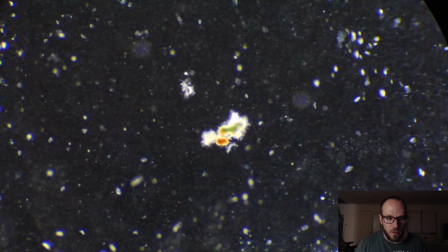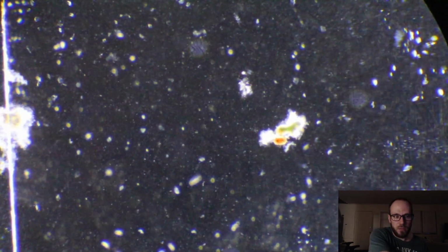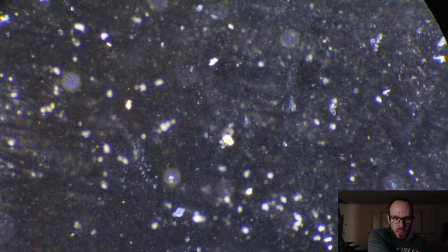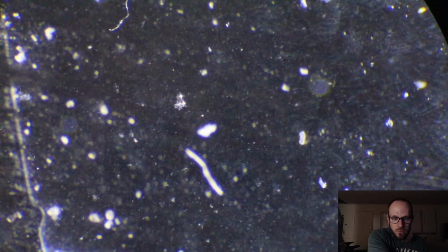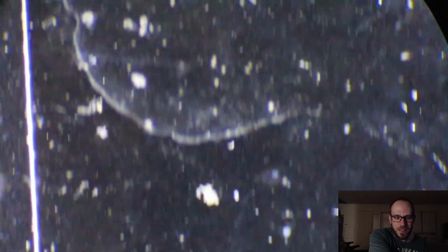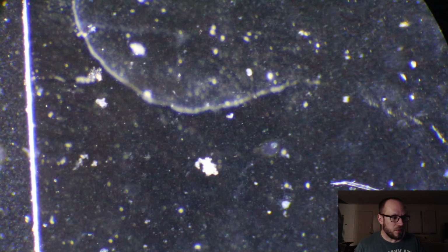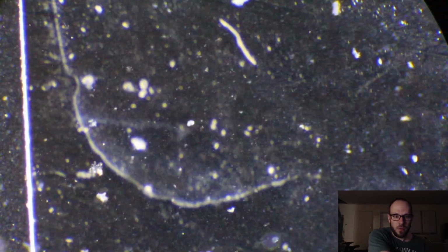I'm still playing with this and figuring stuff out, so all of the 0 people here are kind of my guinea pigs. So yeah, that's a bit of lichen you're looking at right there, a microscopic bit of it. I'm a little surprised that we're not really seeing much of anything yet, but we should. And fear not, even if this slide is somehow a dud... Oh, there's another Paramecium. So a lot of these guys living on either slide, or rather throughout the whole sample.